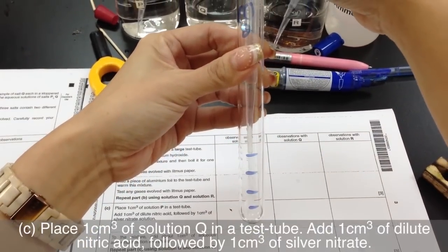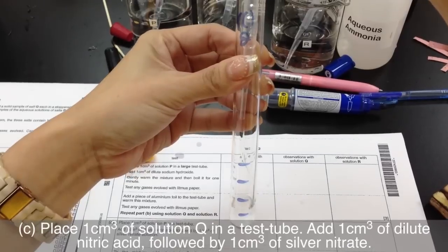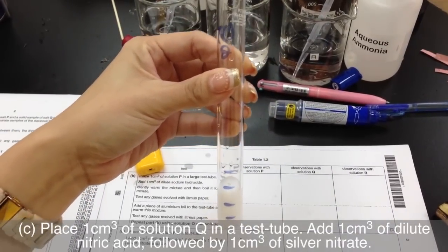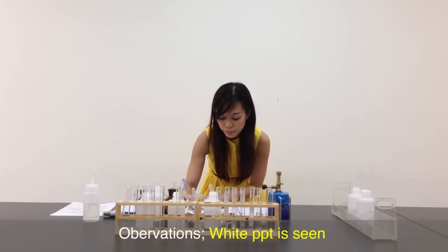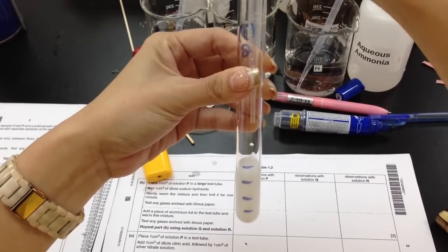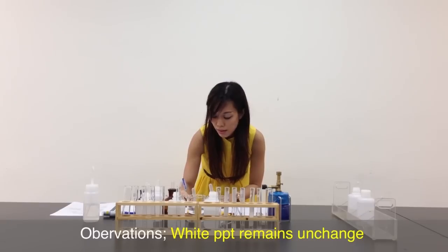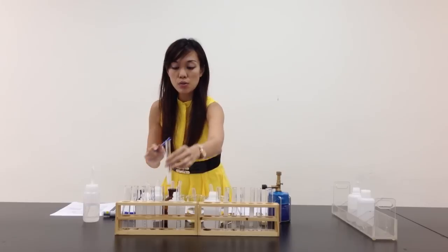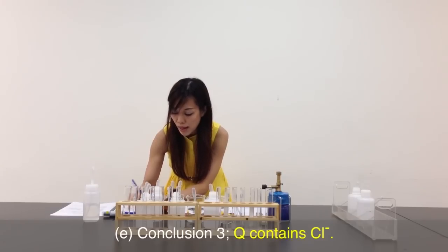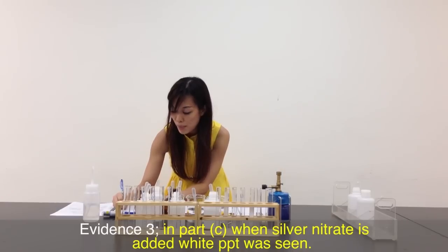Let's move on to Q. Same thing — 1 cm³ of Q, another 1 cm³ of nitric acid, then another 1 cm³ of silver nitrate. There is white precipitate present. Let me quickly write down: white PPT is seen. I need to add another 1 cm³ of aqueous ammonia — white PPT does not dissolve at all. White PPT remains unchanged. When white PPT is seen with Q, it shows that chloride is present. So I go to my conclusion: Q contains chloride. Part C evidence — when silver nitrate is added, white PPT was seen.